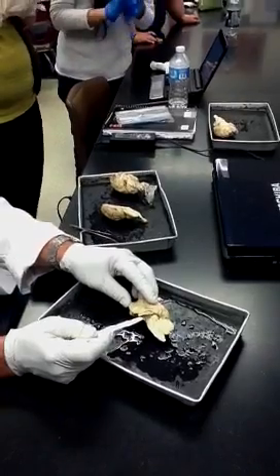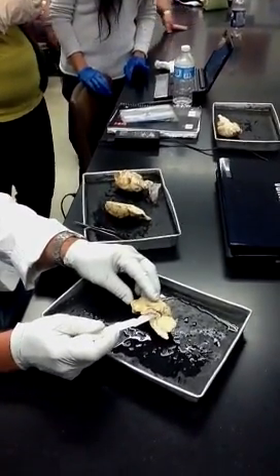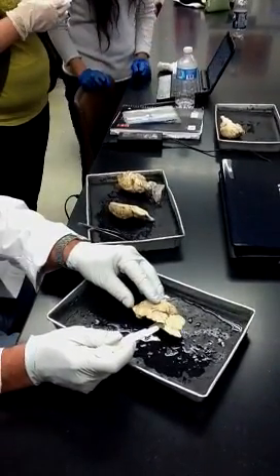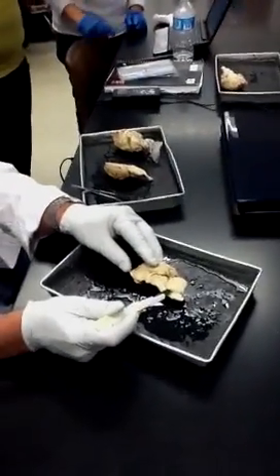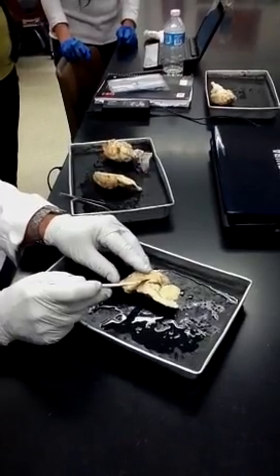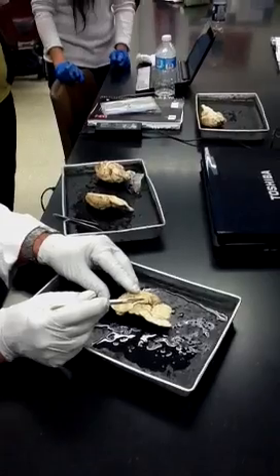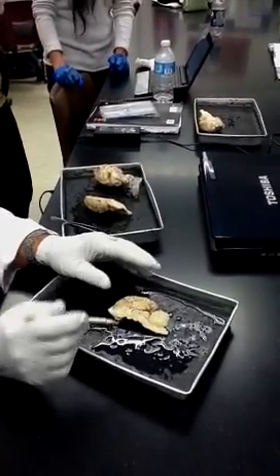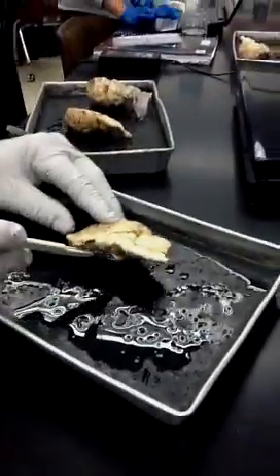You can see on this one, it's really got a nice superior and inferior colliculus. Anyway, this little thing right here is the pineal gland, which is the thing that sets the body clock in humans. And here's the superior colliculus, the inferior colliculus. But you can see on the brain that Ted pulled out, it's got a much more pronounced cerebral aqueduct right here. And this would be the fourth ventricle right there. And this one is already sort of opened up, but if I open it up like that, that's where the lateral ventricle is. In this area of white tissue right above it, we haven't talked about it yet, it's called the corpus callosum. It's the main connection between the cerebral hemispheres. So this is a good one. It's got pretty much everything on it.